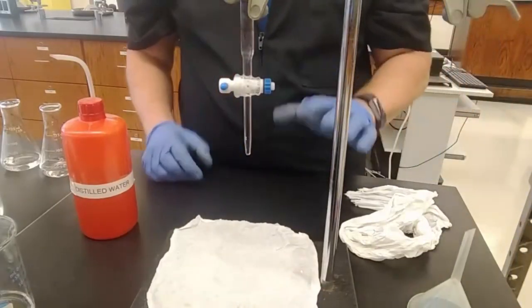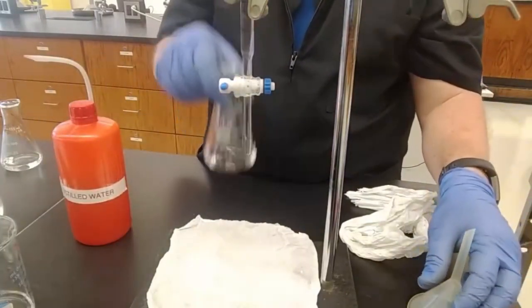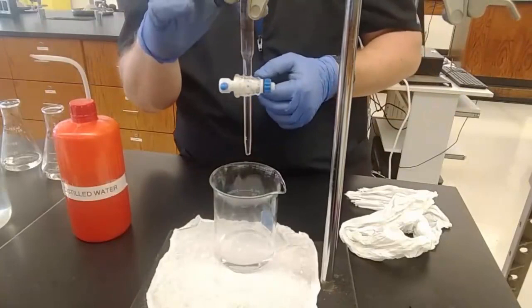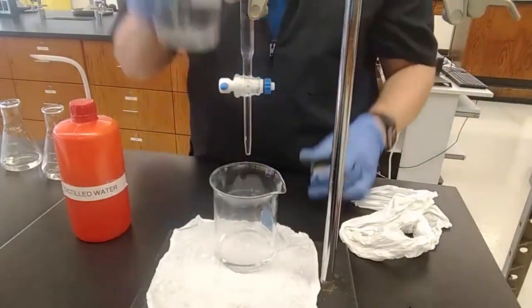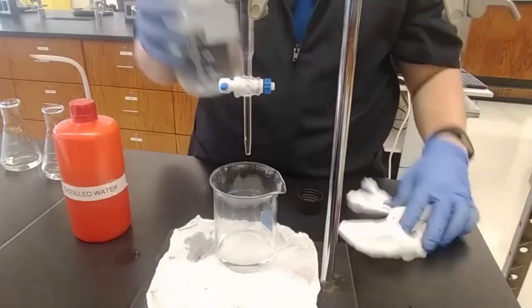All right, I need to refill. I do not refill with experiment number two underneath it, in case I overflow, it would drip in here and ruin it. So, put my waste beaker underneath. I need to refill because I don't have 17 milliliters left. I'm at 20 point whatever, and it only goes to 25, so it'll run out. So, I add another whatever number of milliliters. See, it's good I didn't have that flask under there. I had a drip. Okay, and another one.